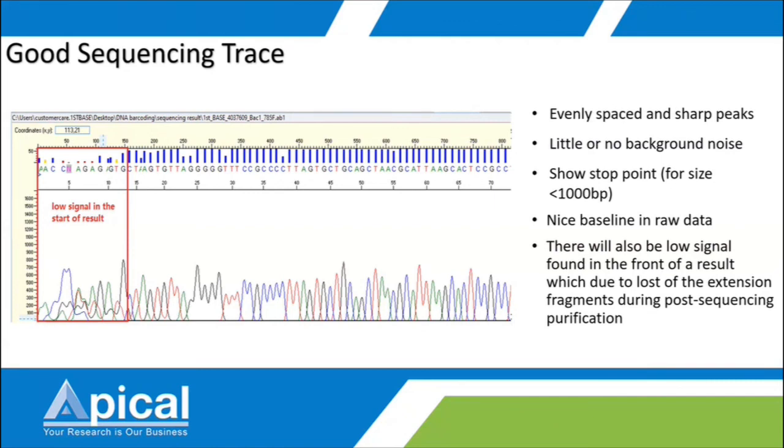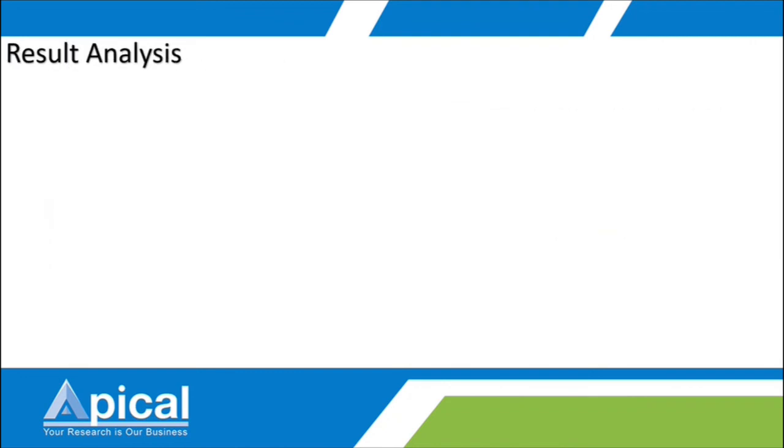For your information, this is actually just due to the loss of some extension fragments upon the post-sequencing purification, because purification will certainly cause some loss, especially of short fragment DNA. So it is normal.